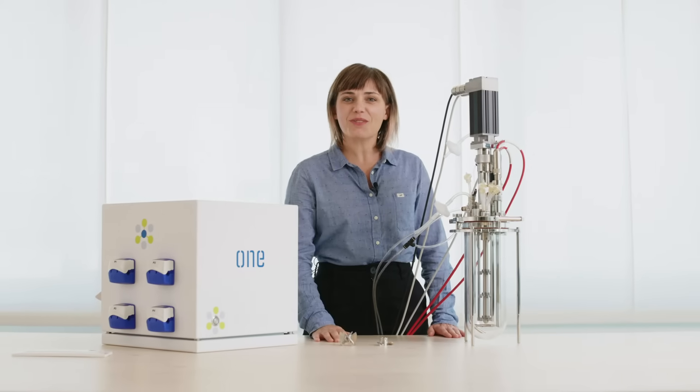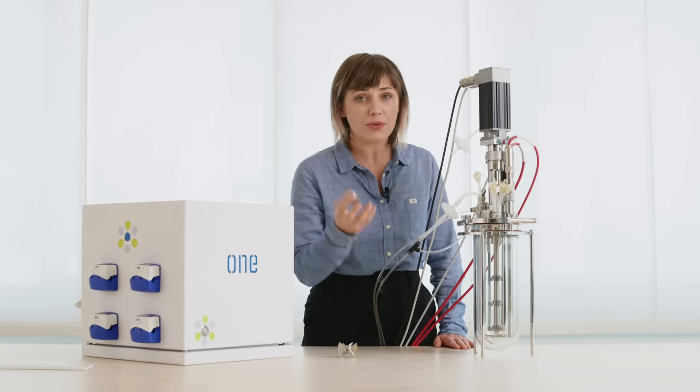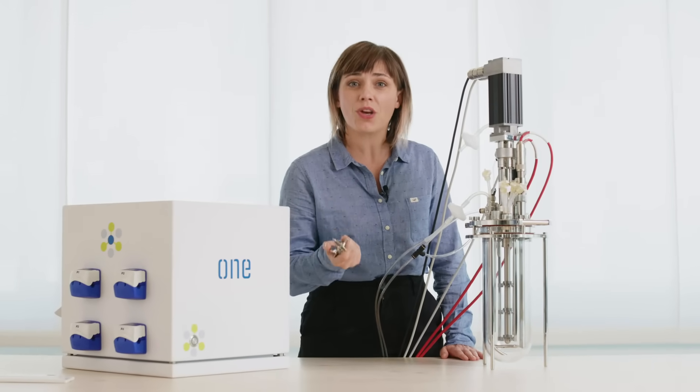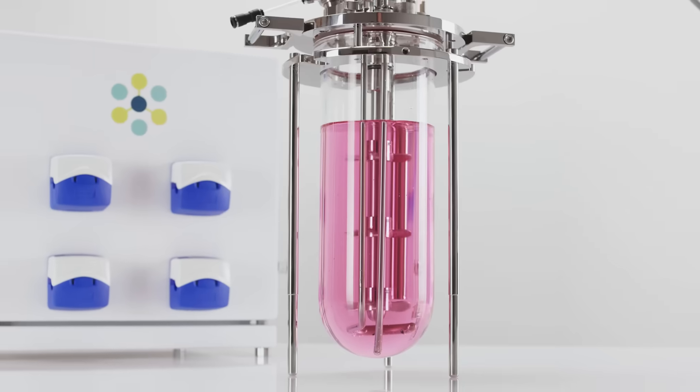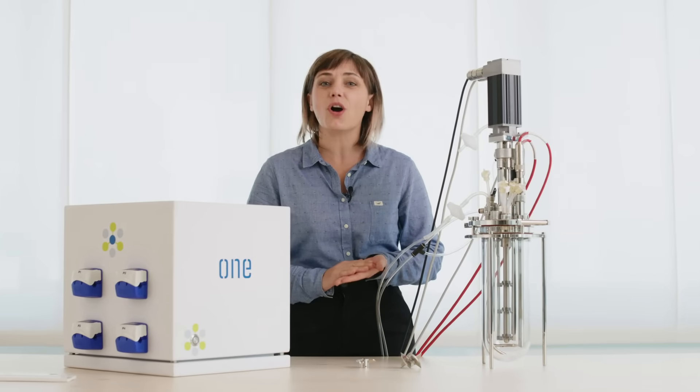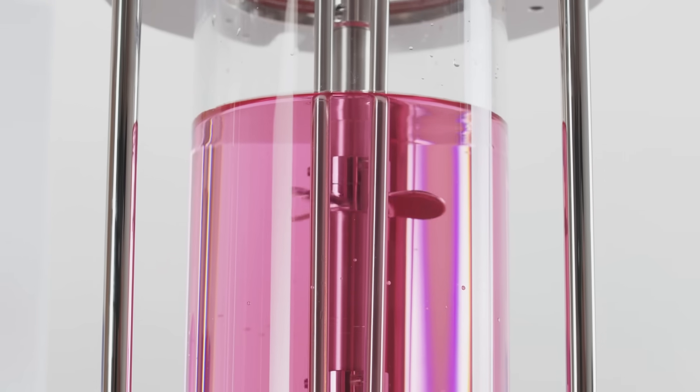As you can see, I've chosen Rushton, but there are options for marine or pitch blade impellers, whatever suits your process need. Accurate and powerful RPM control from 1 to 1900 RPM. Ring sparger or sintered for micro bubbling.